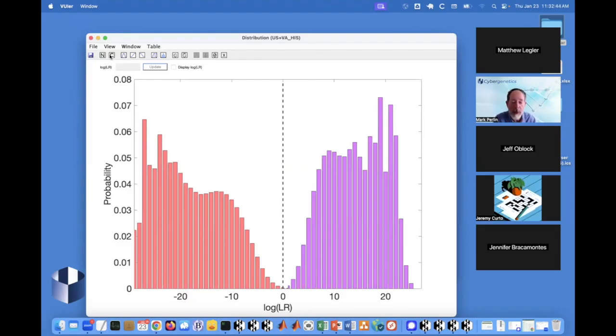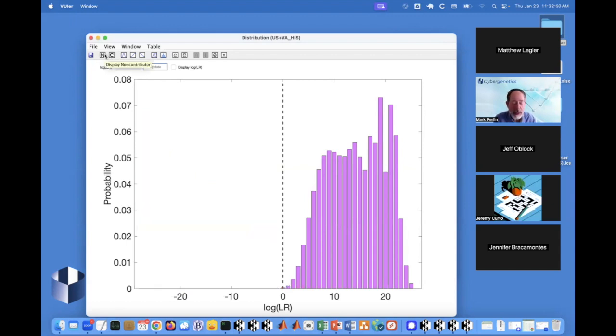And the reason you want the contributor distribution, you can turn off the left one, is because now you can do exactly the same work, not just understanding the sensitivity, but calculating specificity for exclusions. The left edge of this curve, to the left of 0 and moving leftward, gives you error rates about the lab in a validation study.